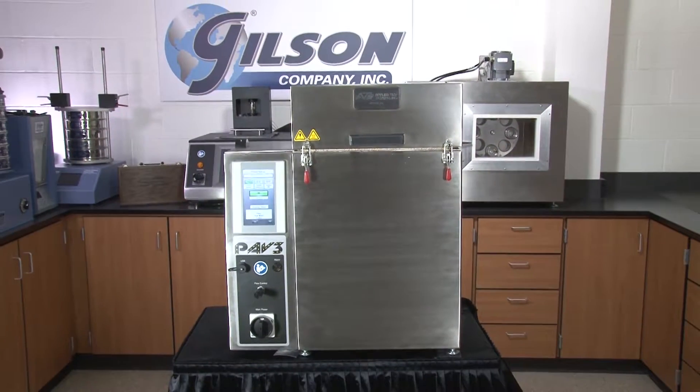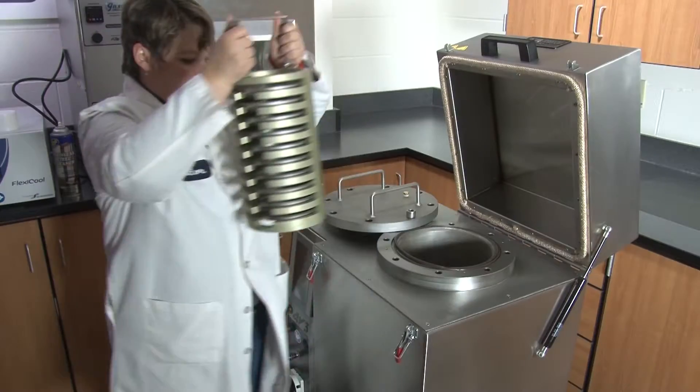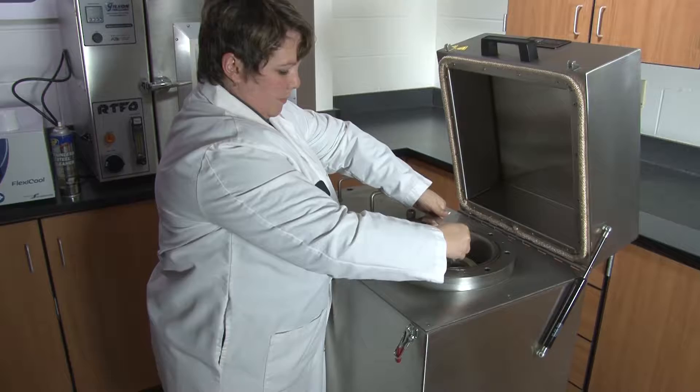This easy-to-use system completes a test in three easy steps: press the heat button, insert specimens when prompted, and press the age button.